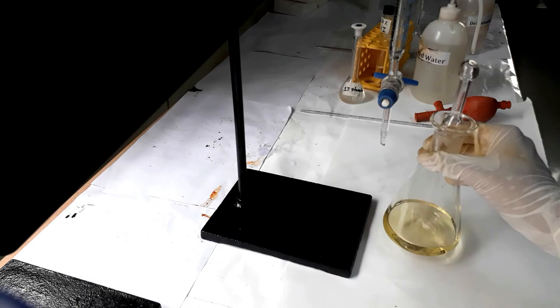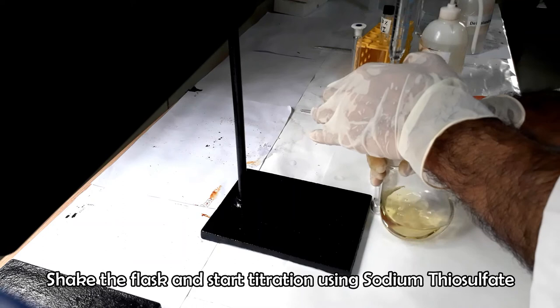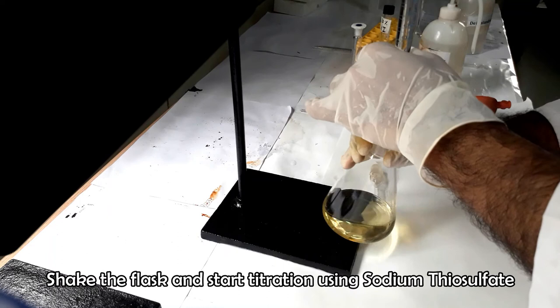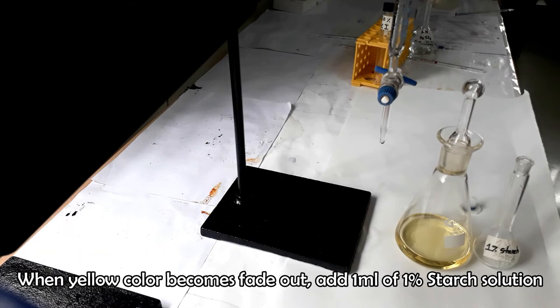Take 0.005 normal sodium thiosulfate in a burette. Note the initial burette reading. Start titration by liberating the sodium thiosulfate solution from the burette. If the yellow color starts to fade out, add 1 ml of 1% starch indicator solution and resume the titration with vigorous agitation of the flask.